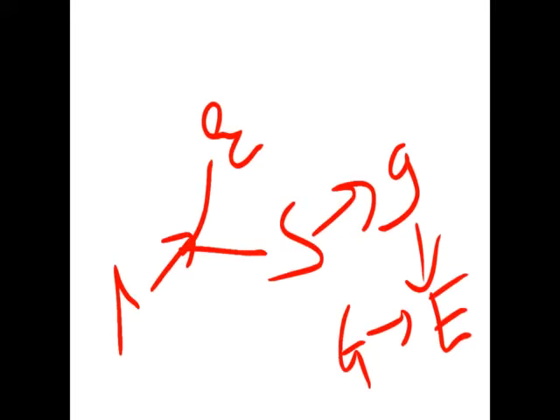So here the principle of flame photometry and atomic absorption spectroscopy changes. Some of the elements can transfer from ground state to the excited state, but some of the elements remain as they are in the ground state, and the study of these ground state elements which absorb these radiations is the principle of atomic absorption spectroscopy. Are you getting my point?